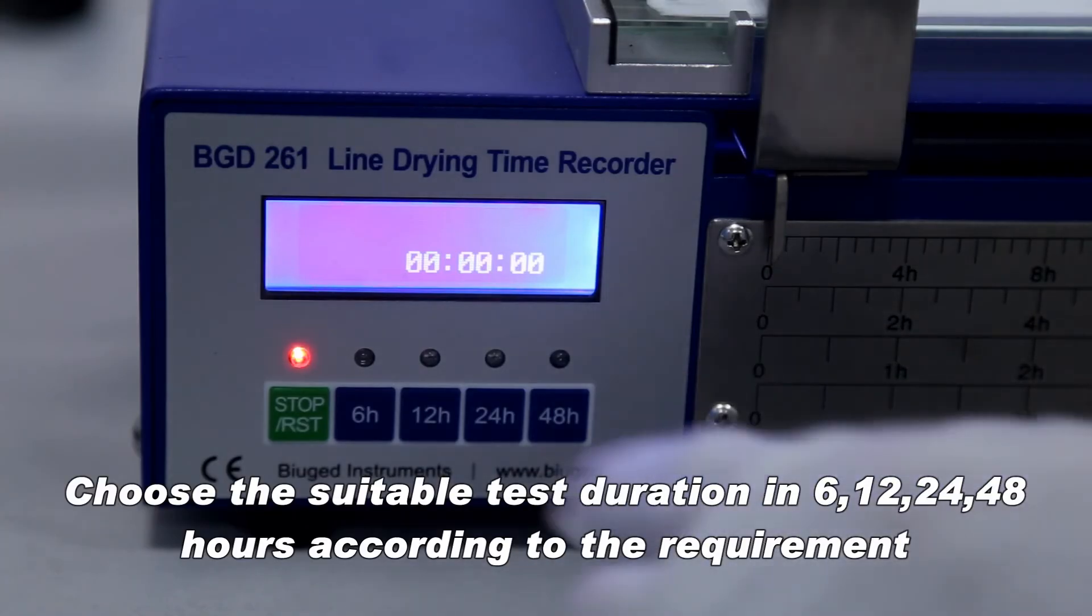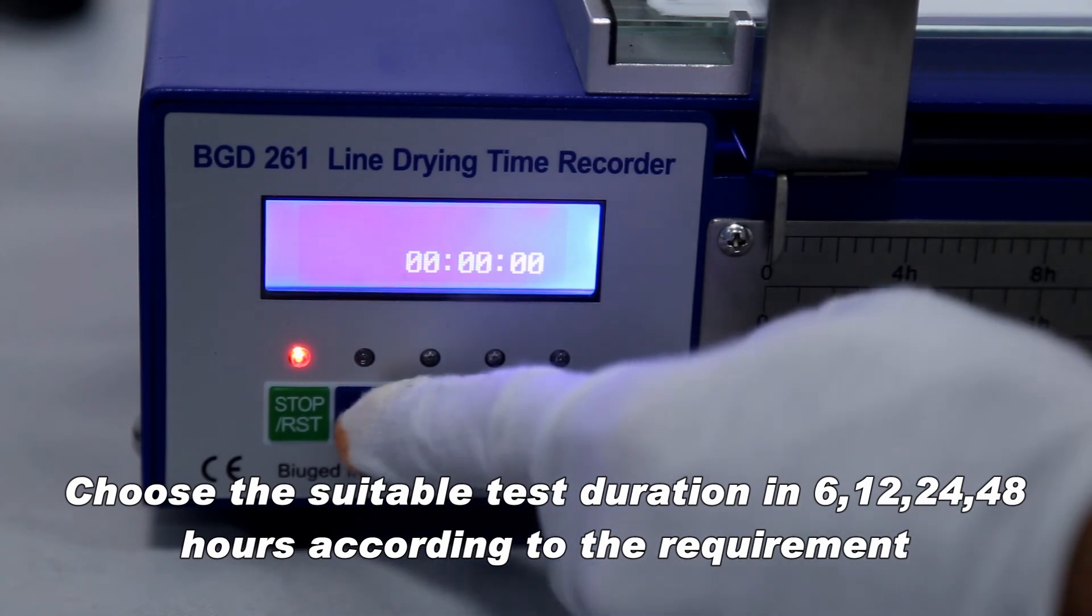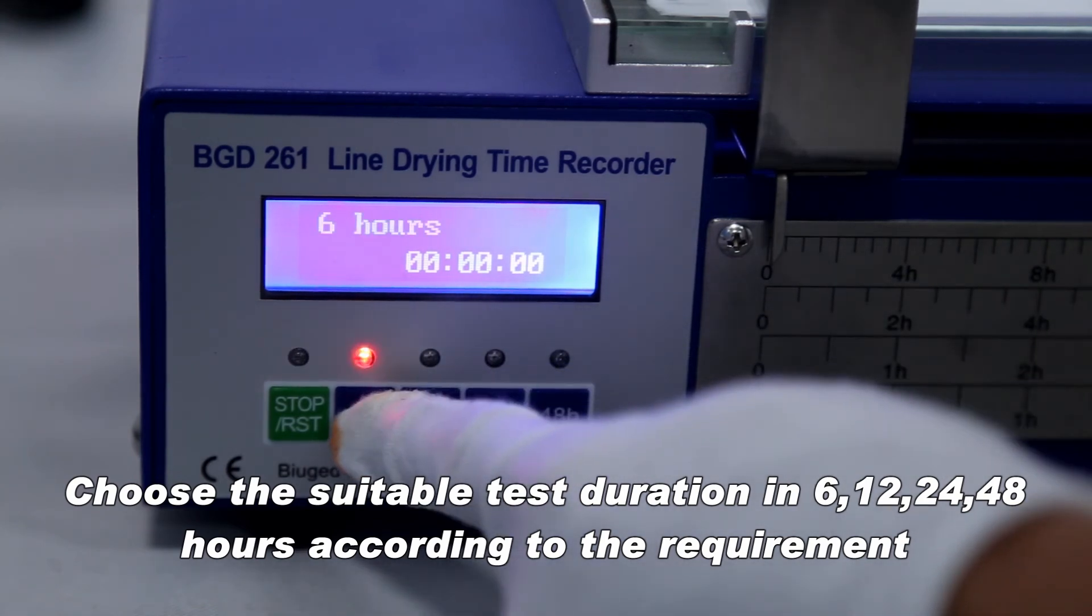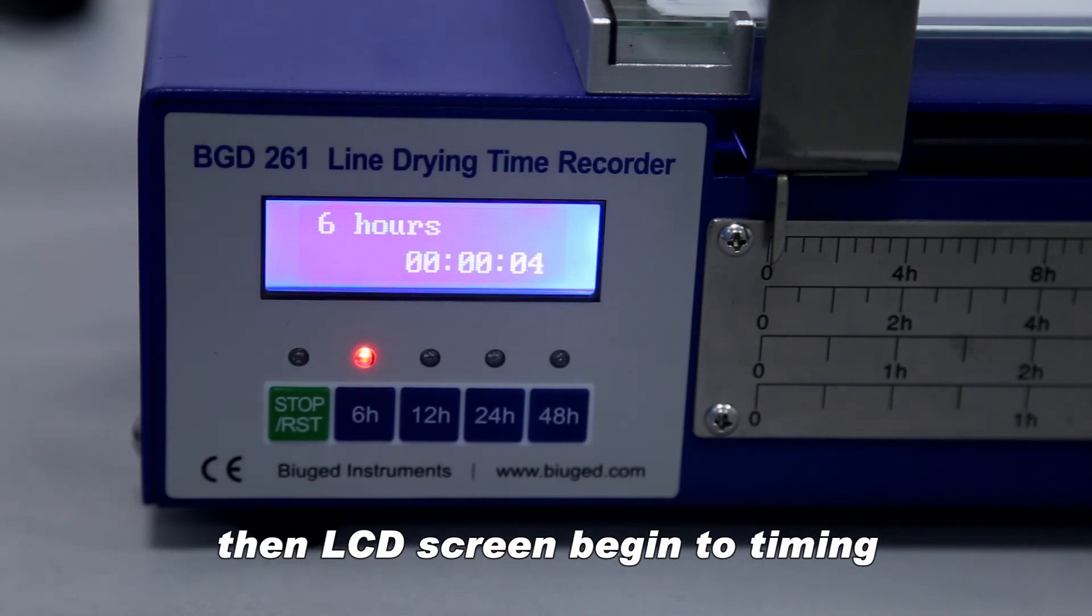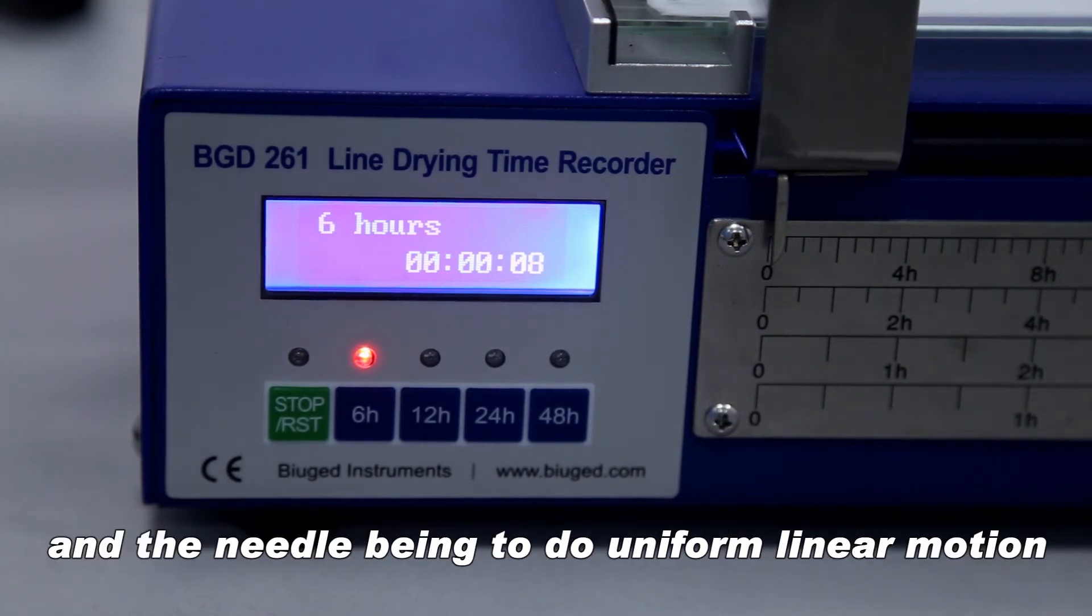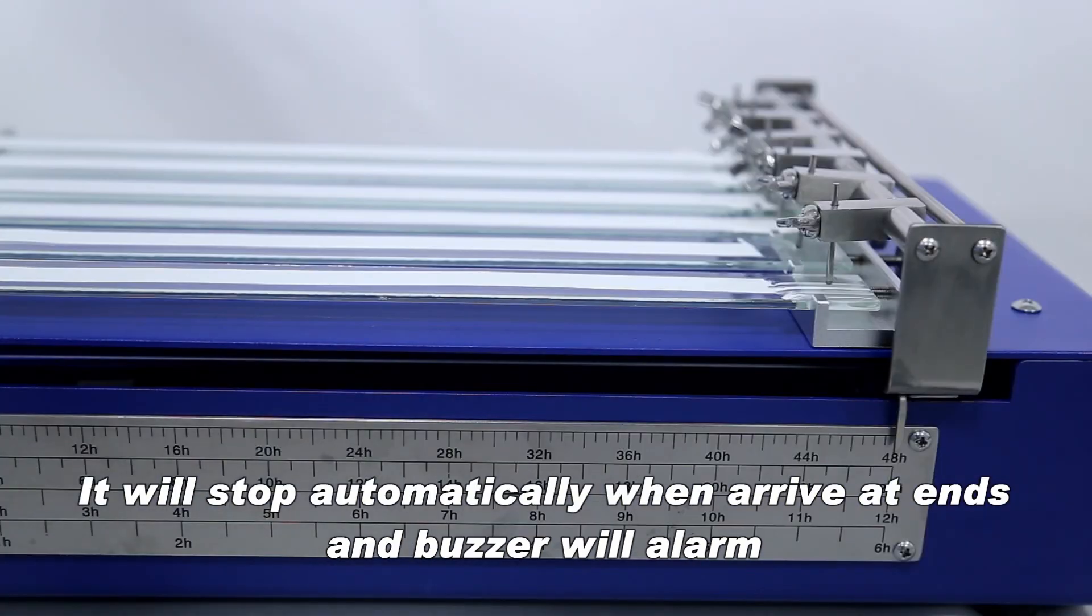Choose the suitable test duration of 6, 12, 24, or 48 hours according to the requirement. The selected speed button will light, then the LCD screen begins timing. The needle begins to do uniform linear motion. It will stop automatically when it arrives at the end and the buzzer will alarm.